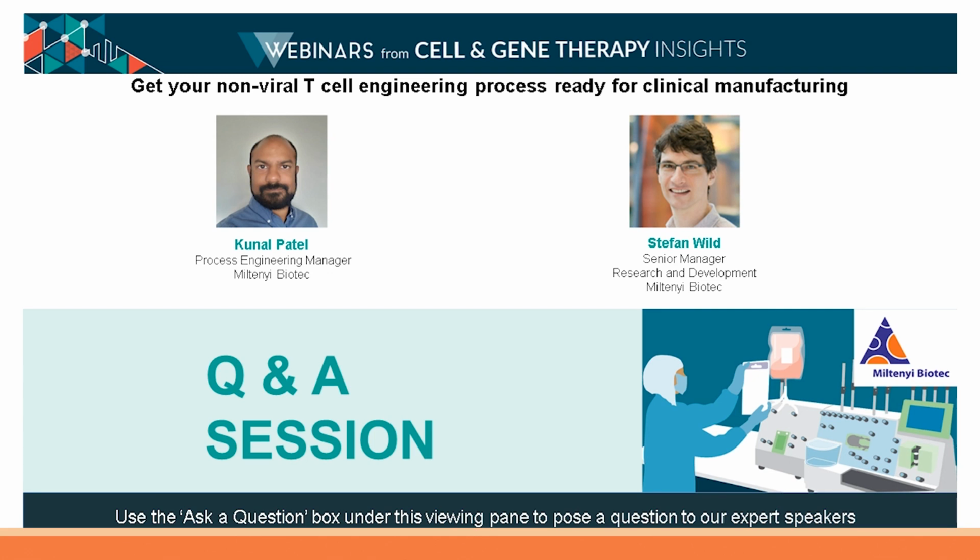Excellent. And I've got another technical question here. Not sure who wants to answer this. For the electroporation unit, what capabilities are possible regarding the pulse applications? So, for example, what pulse magnitudes, durations, waveform shape, and pulse numbers are possible to program into it, or is it pre-programmed into the protocols? So, for T cells, for example.